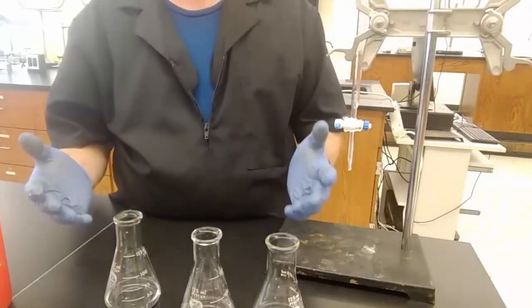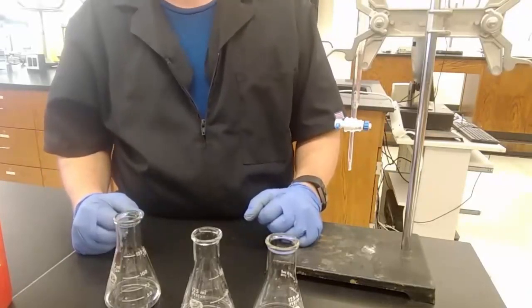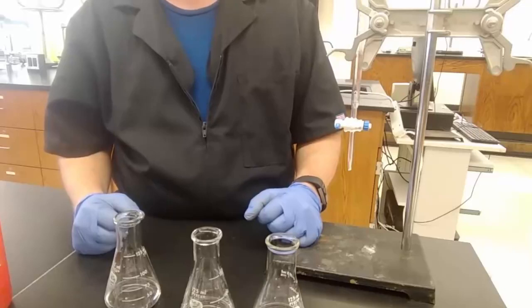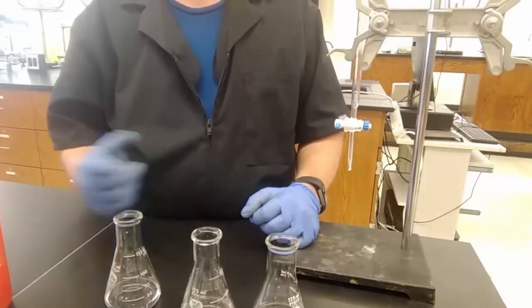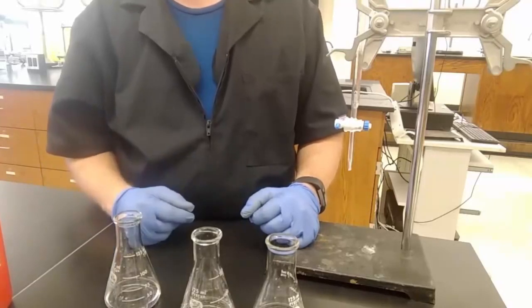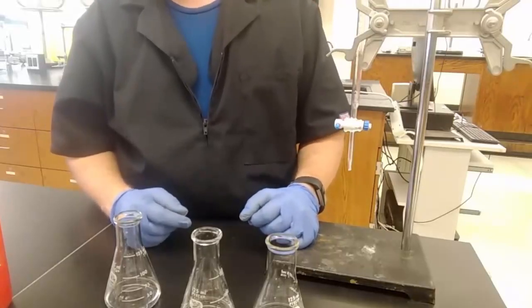No color change. You can't tell when the acid has reacted with the base. Why do you not add more than 2 or 3 drops of indicator? Because it's an acid. That's how it changes color. When its H+ comes off of it as an acid, that's when it changes color. So if you add a whole bunch of extra indicator, you end up with a whole bunch of extra acid, and that messes with your reaction.